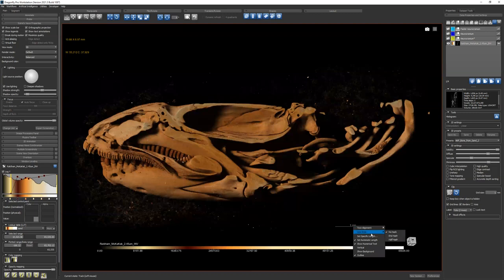You can change your line style. You can set a specific length. And that's about it. So just a few different ways you can change it, but you can't use the scale bar unless you have this orthographic projection selected.